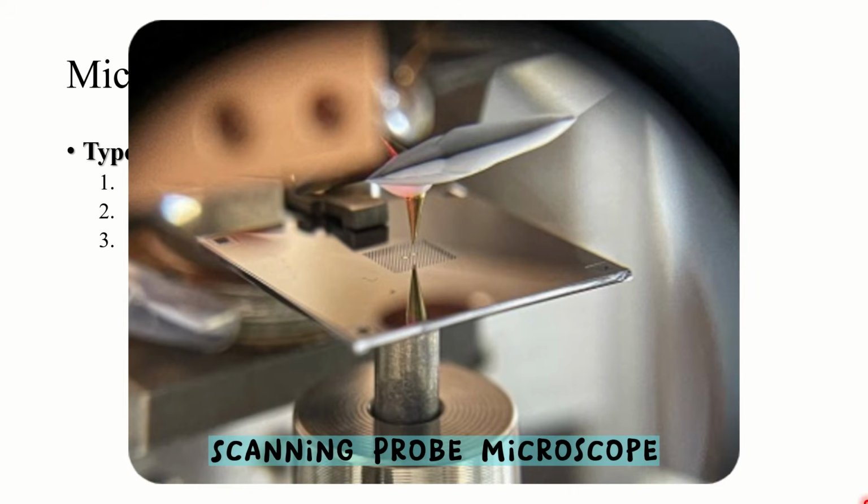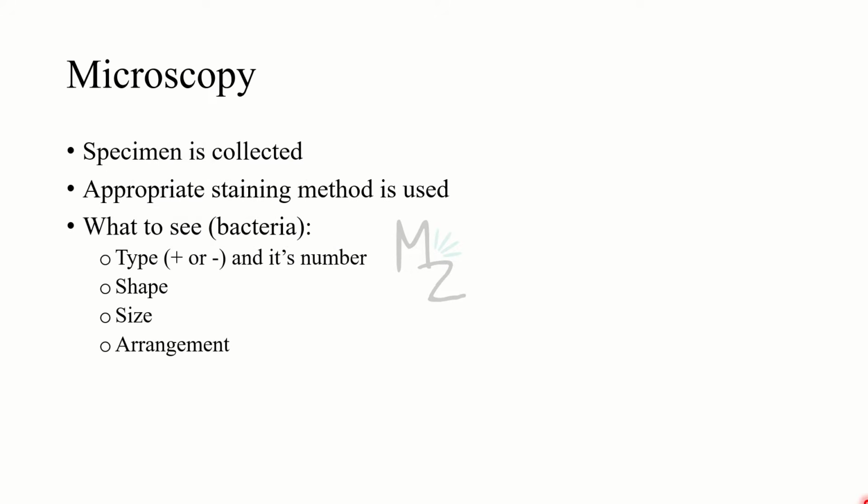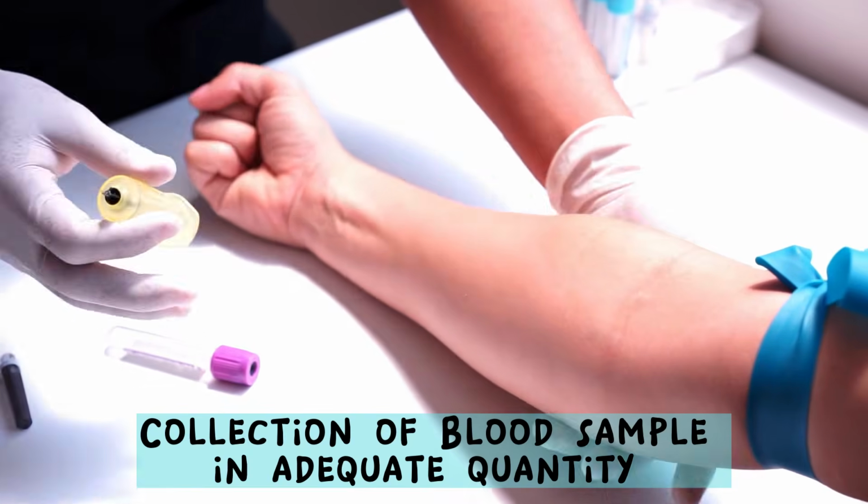In order to image surfaces and material with extremely high resolution, scanning probe microscopes use a physical probe to scan the specimen's surface. What is the method of microscopy? Prior to any procedure, as I mentioned, we will collect the samples.